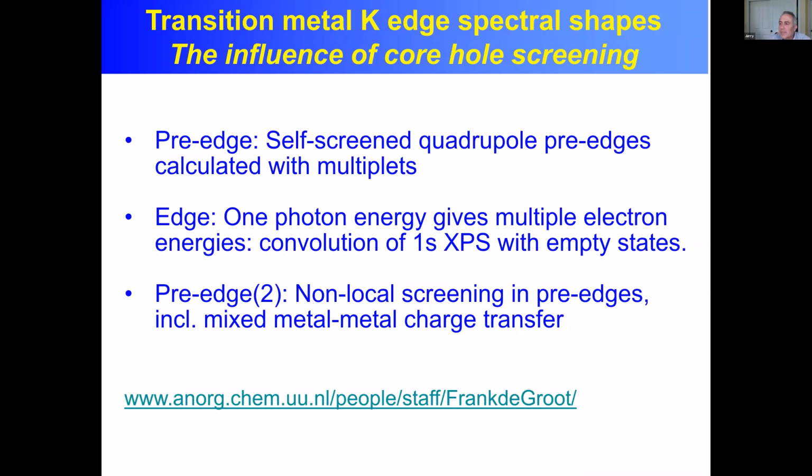Excellent, thank you. First question is whether in the past this extra peak had been assigned to shake up or shake down effects, referring back to the cobalt oxide data, I think.